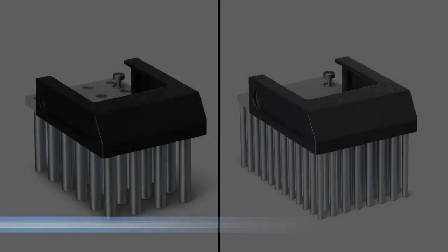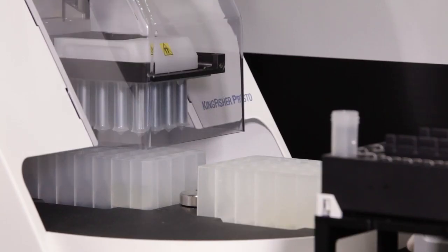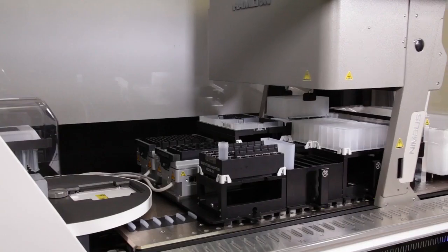You can choose between two magnetic head options to purify 24 or 96 deep well plates at a time, depending on your volume, throughput and reagent needs.